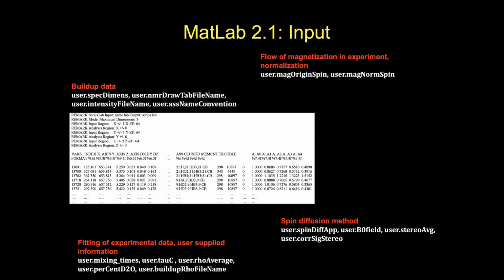If you just detect peaks in just one NOESY, we're not talking about NOESY series right now, you will have one parameter that unfortunately is not shown here. I really regret it because it's a relevant one. It's the intensity parameter. It's called height here, and it will be among these dots. This is the peak intensity. That's what we are interested in.